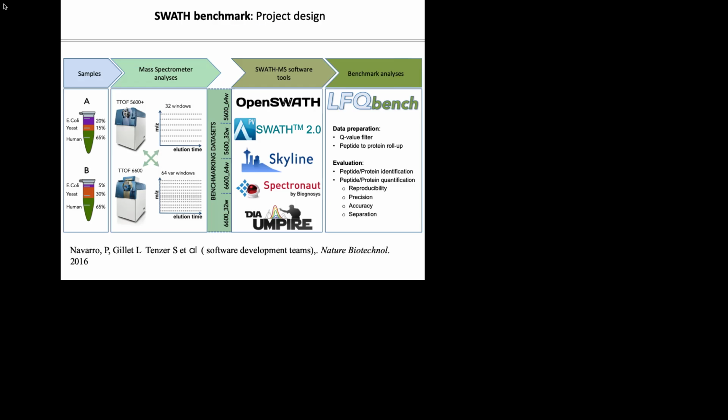Now, in the meantime, there's been a whole slew of additional tools that have been developed, which have not actually been benchmarked. It would be maybe a good thing for everyone who has a new tool to also run this against this ground truth data set and see what happens. Pedro Navarro here, the first author who actually did this analysis, created kind of a comparison workbench. So if someone is interested to do something like that, you could, in fact, download all these programs that now exist, download the data, and then use this workbench to do this comparison. It would actually be an interesting service to the community.